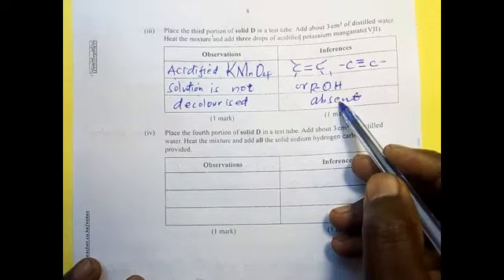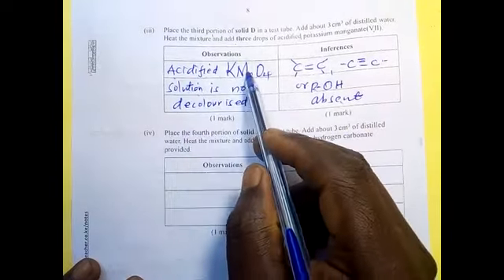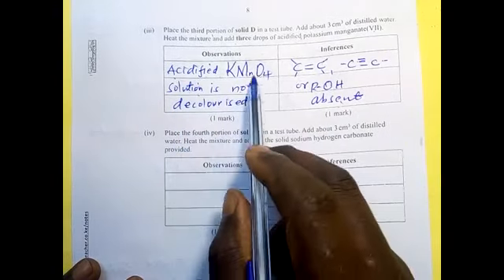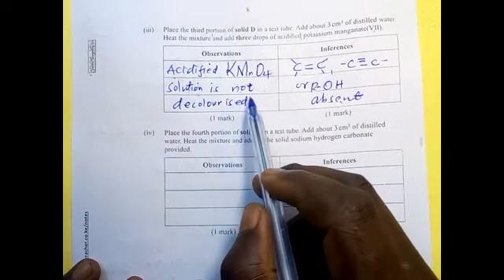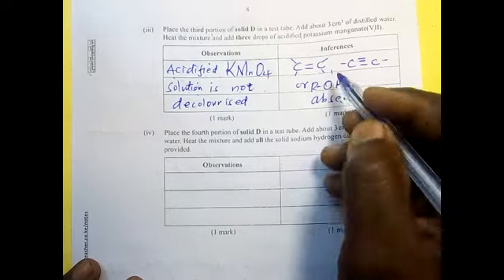If these were present, the acidified potassium manganate would be decolorized. It could change from purple to colorless. But now it didn't do that. Therefore, it means that these 3 are absent.